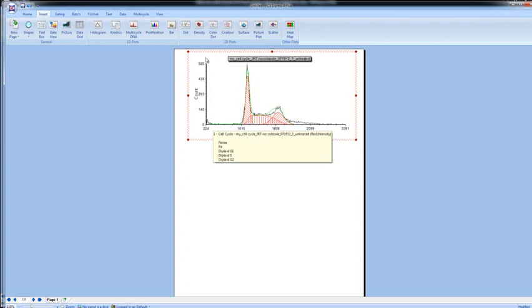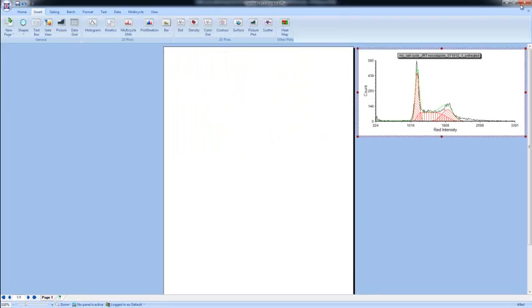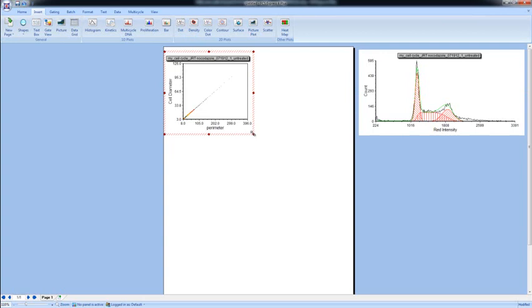So the first thing I'm going to do is move this plot off of the page here a little bit. And again, we're working in FCS Express, and this is going to work just like PowerPoint. So if I want to insert an object like a new density plot, all I have to do is click on that density plot, draw it, and now we'll have a density plot that represents all the cells from this Nocodazole treated sample. So what I really want to look at here is perimeter versus circularity as our first parameter.